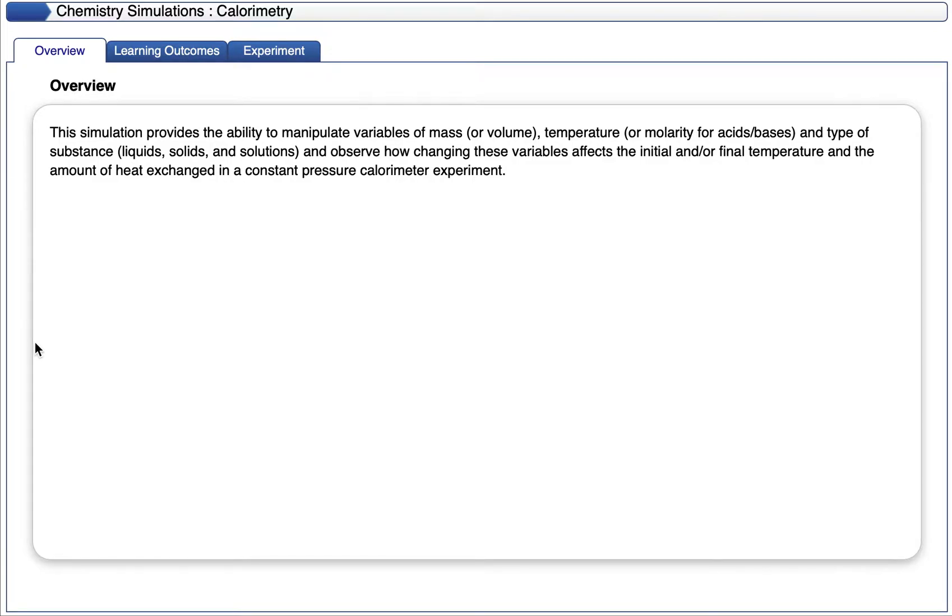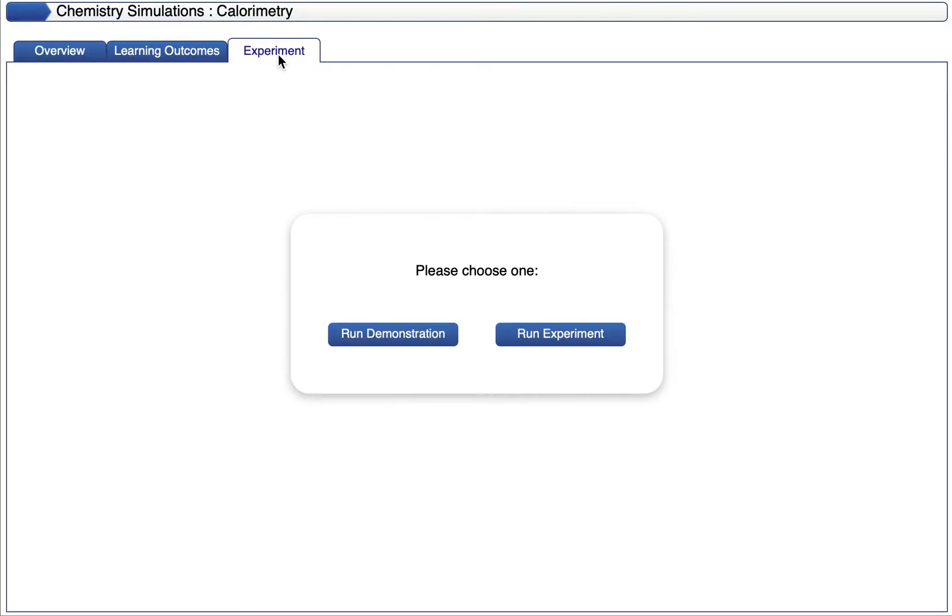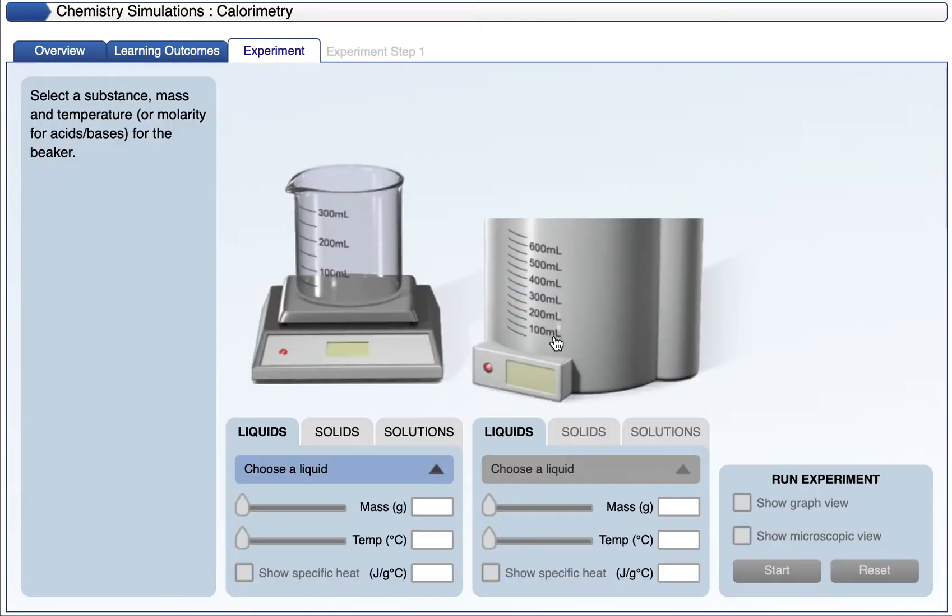In this presentation, we will examine the calorimetry experiment that's available online as a simulation. When you pull up the simulation, you can hit experiment and either run a demonstration or run the experiment. We're just going to go ahead and run the experiment.